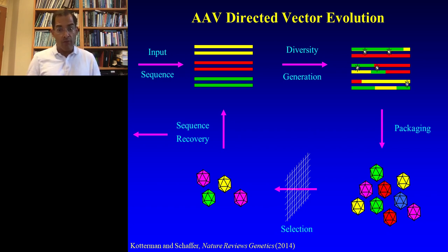So all evolution involves two steps: genetic diversification to create a rich gene pool, and then Darwinian selection to the fittest. So we have used 37 different approaches to create 37 individual libraries of the cap gene in which we've introduced diversity into that capsid in a variety of different ways. We then take this very, very large pool, which in sum total amongst those 37 libraries that we simply pool all together to create a master library, we have several hundred million variants of AAV, which we think compares quite favorably to around the half dozen AAVs that are currently used within the clinic.